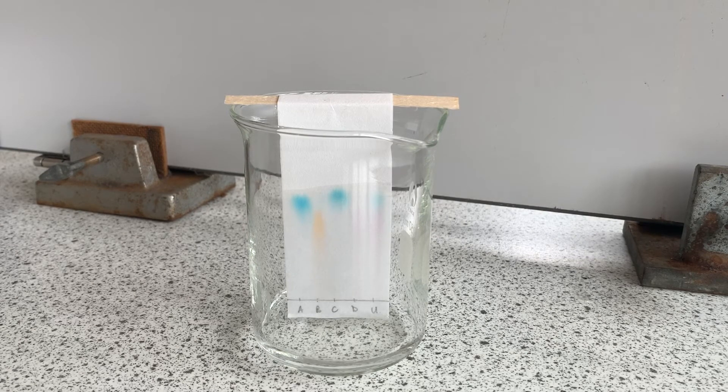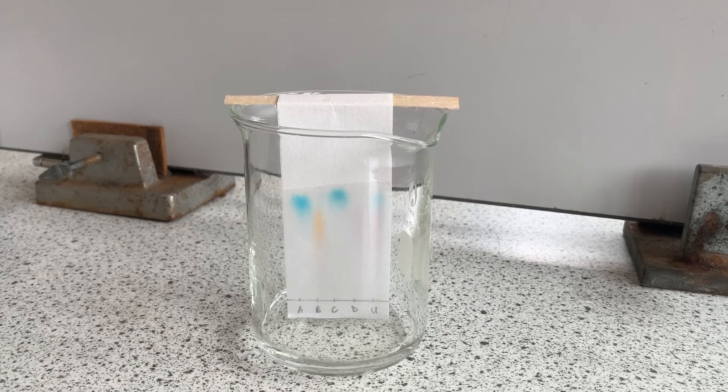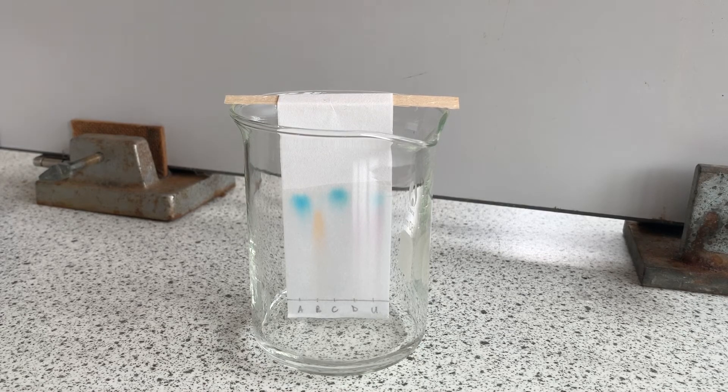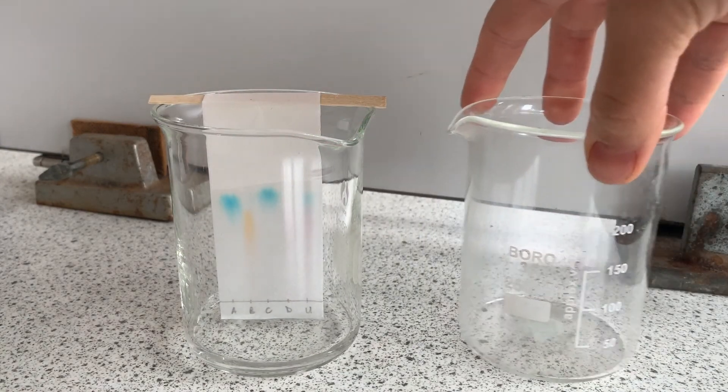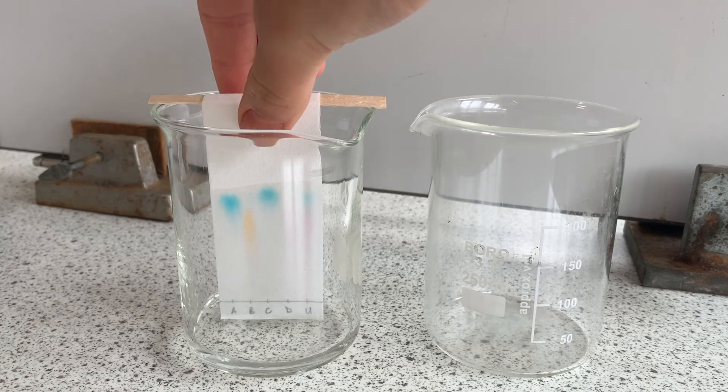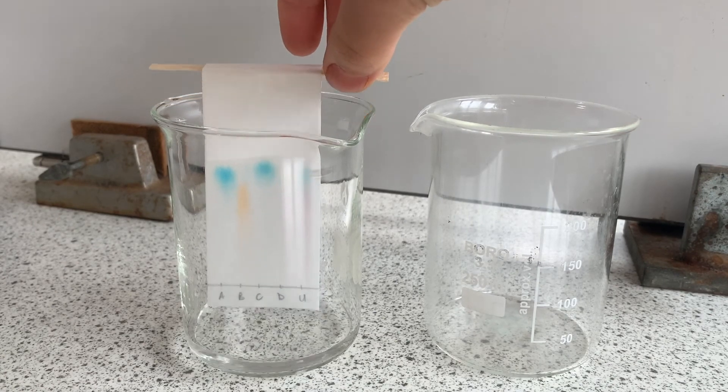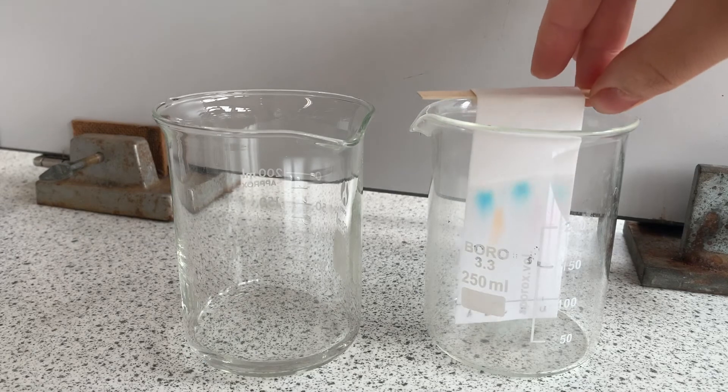Once the different spots have travelled up the paper to these different distances and before the solvent reaches the top of the paper take it out and suspend it into an empty beaker to dry. It's a good idea before the paper dries out completely to mark the solvent front before you can't see it anymore.